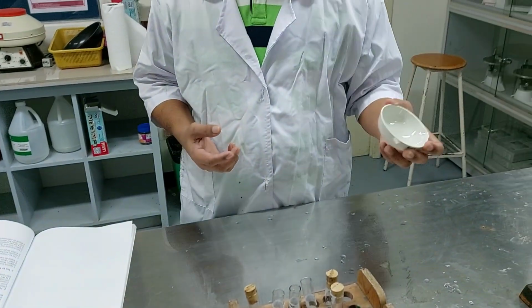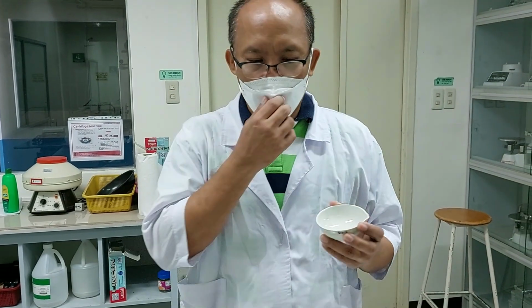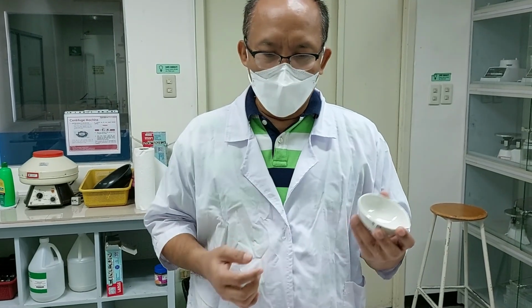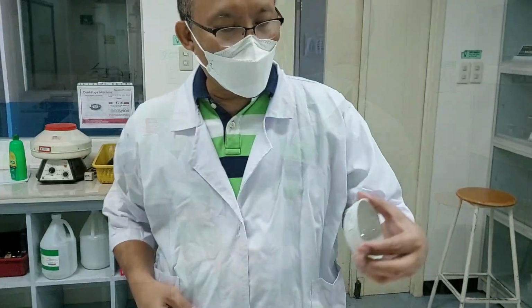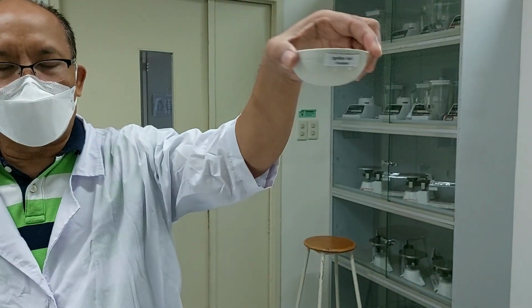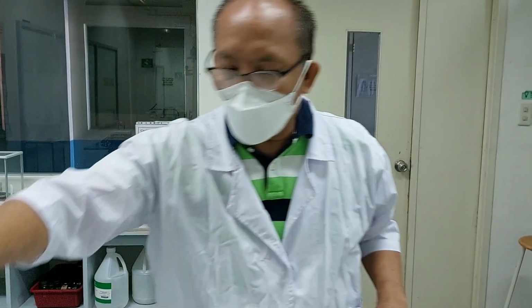So we do what we call the ignition test. We have to use the evaporating dish, and we're just going to place 3 drops, to avoid fire, because we are burning this one. Here we have the hexane. We're going to place 3 drops here. And here we have benzene, also 3 drops. This is our reagent, hexane, a liquid, and we have our aromatic, benzene, which is also a liquid. So we're going to place 3 drops.